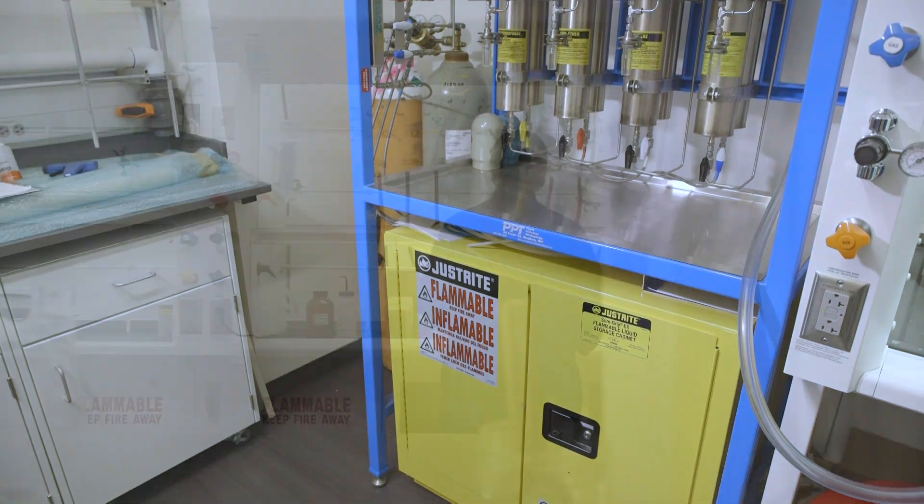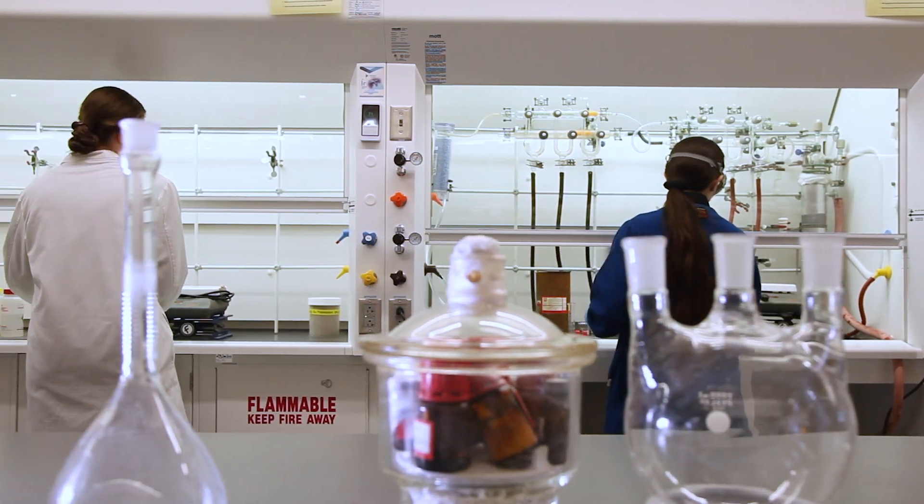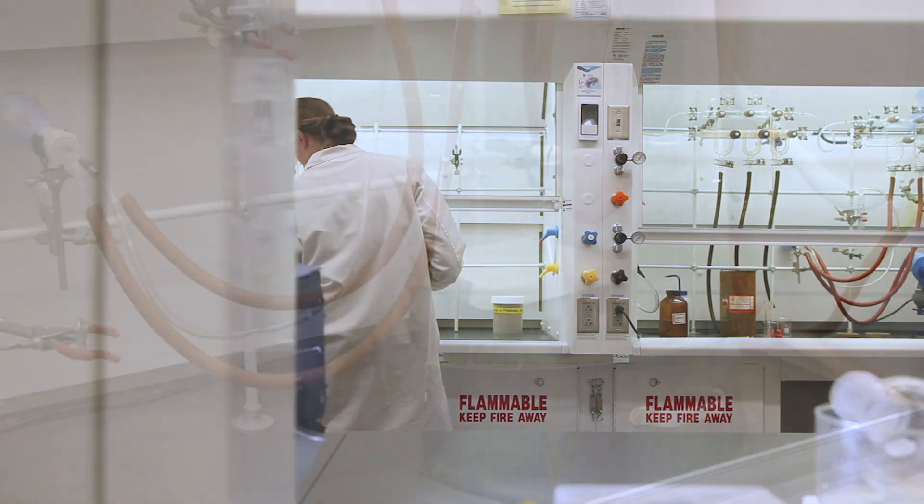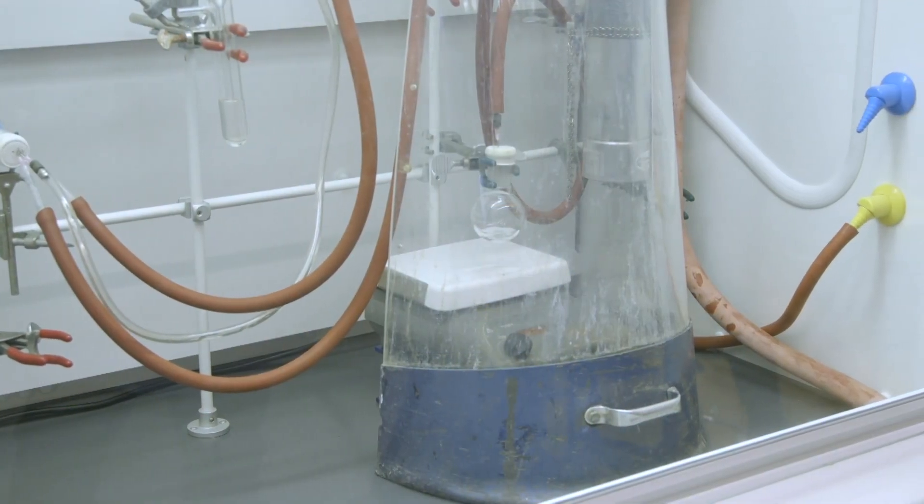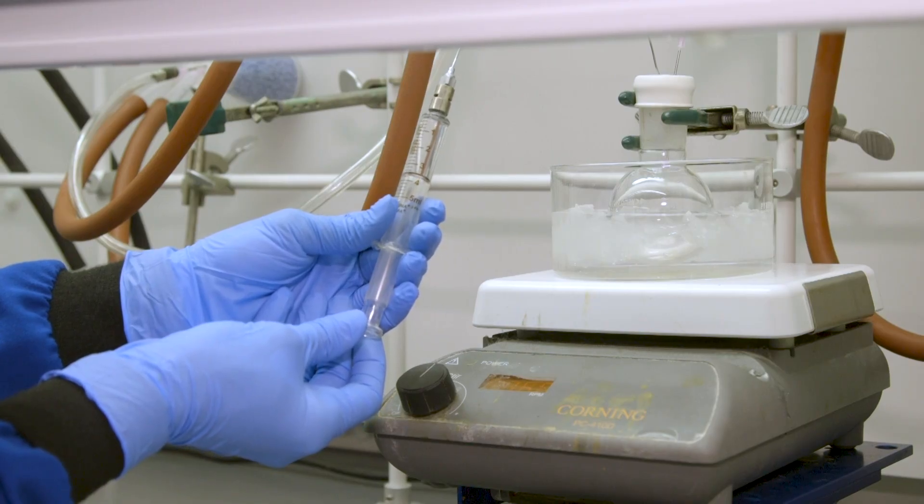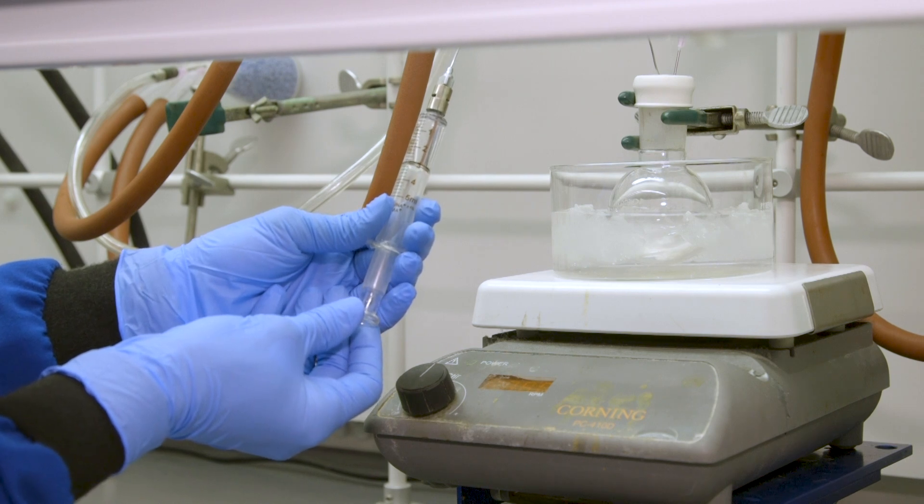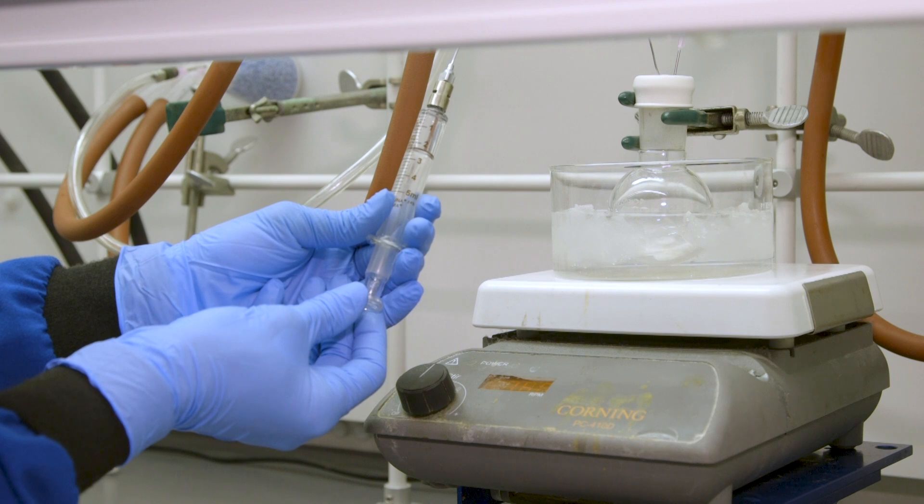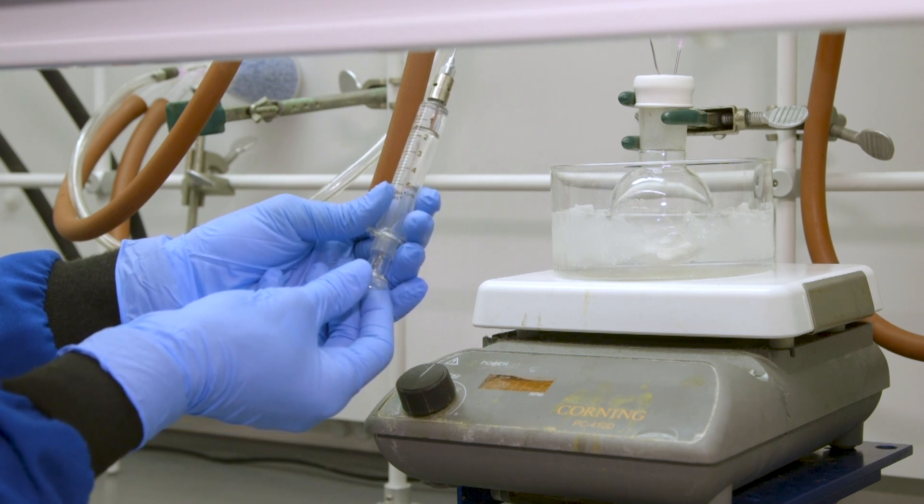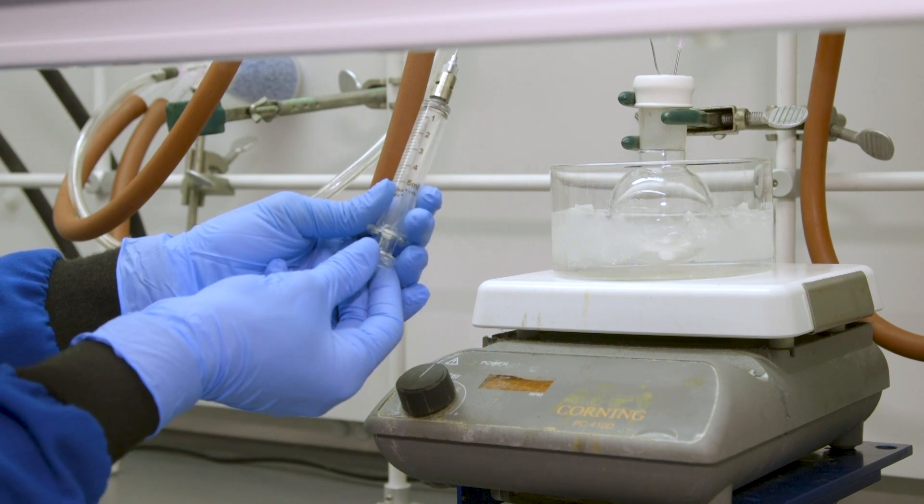Alternatively, the freeze-pump-thaw procedure is an effective way to degas solvents for use, but carries a heightened risk of shattering glass. If your lab decides to use this procedure, take appropriate safety precautions such as the use of a blast shield. Hygroscopic solvents will be transferred to the reaction apparatus with the aid of a syringe or cannula to avoid absorbing moisture from the air. High boiling point solvents can be degassed of any trapped air by alternatively purging the system with the inert gas and then evacuating the system using the connected vacuum source.